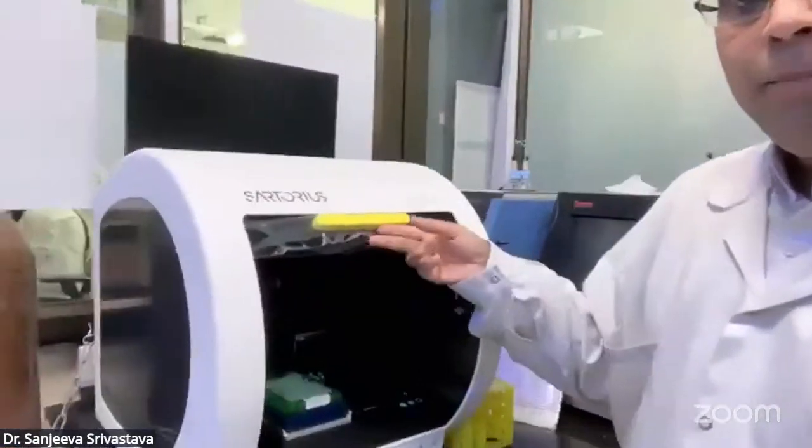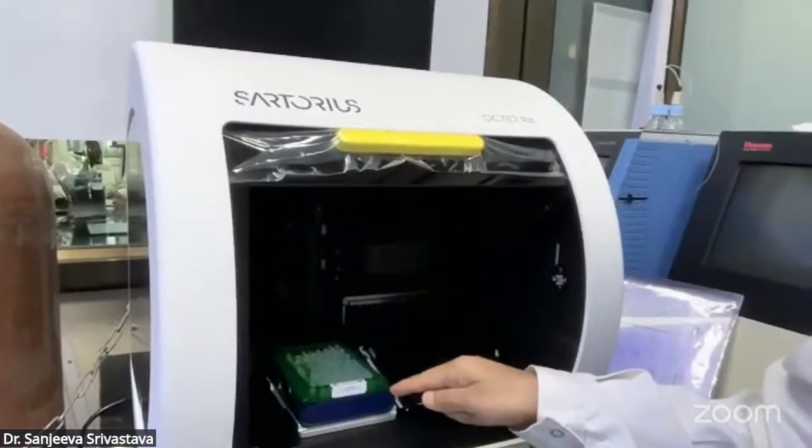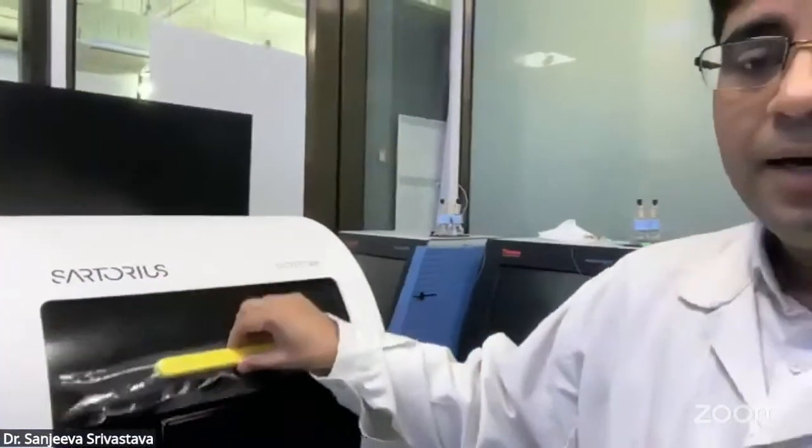A technology which could also be of interest is this instrument, known as the BLI, or biolayer interferometry. Here we have the biosensors, and then we have the plate where you can keep a sample. We are looking at protein-protein or protein-drug interaction analysis. You're using the biolayer interferometry technique to monitor the physical changes across two different molecules. This could be done in a high throughput manner, and one could use it to screen the proteome. So I hope you are getting the broad sense of it.